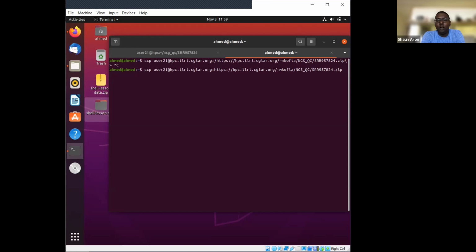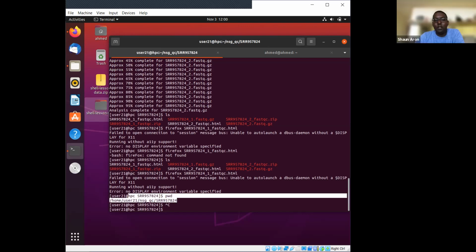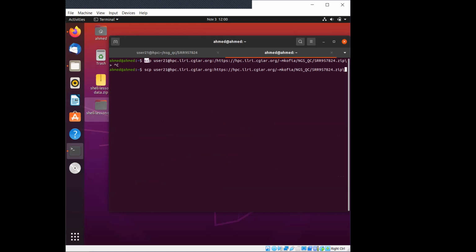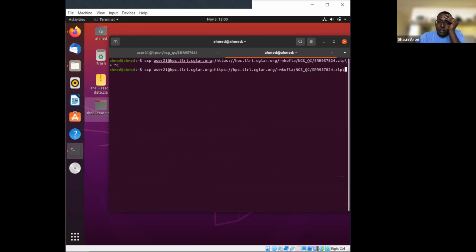Shaun, I think he didn't copy the path. I think it pasted the wrong thing. Oh, I copied the wrong one. Is it this one? No, you didn't paste the right thing. It didn't copy it, I don't think so. Okay. No, not that. Is it this file, SC user blah blah blah, then HCML, which one? Has the zip at the end? No. Oh, okay.